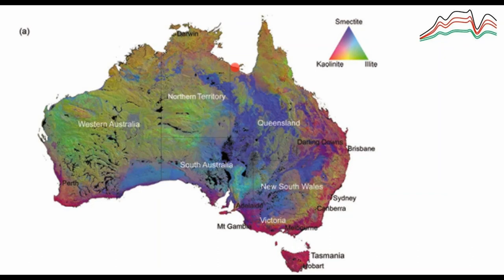And of course, these three clay minerals have their own properties. Like they make soils have this self-mulching behavior if you have more 2-to-1 clay minerals, etc. So that you have an idea of how different clays are distributed in Australia. And this is just using soil spectroscopy.